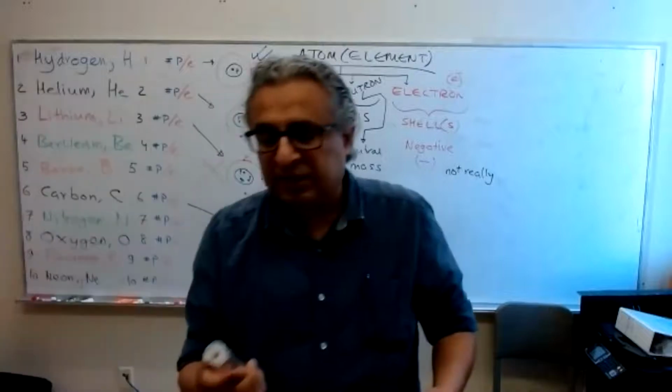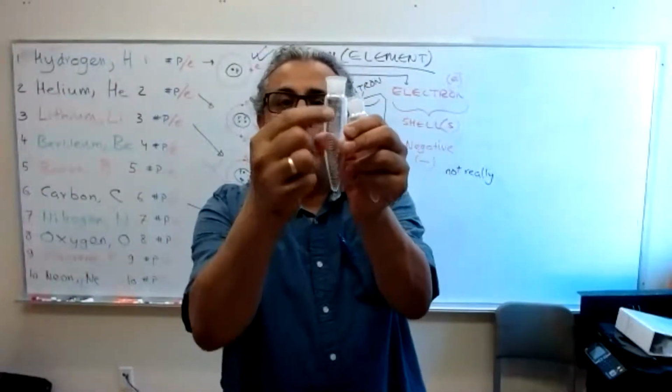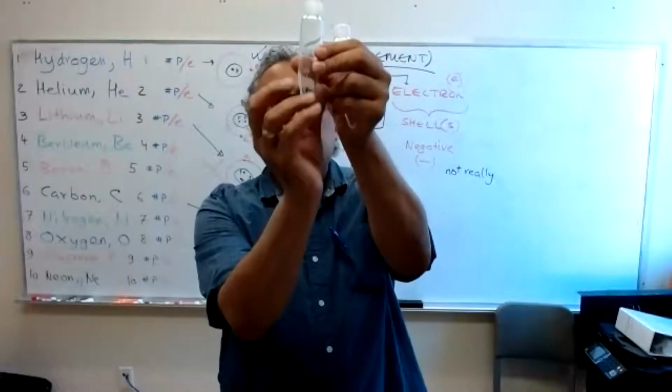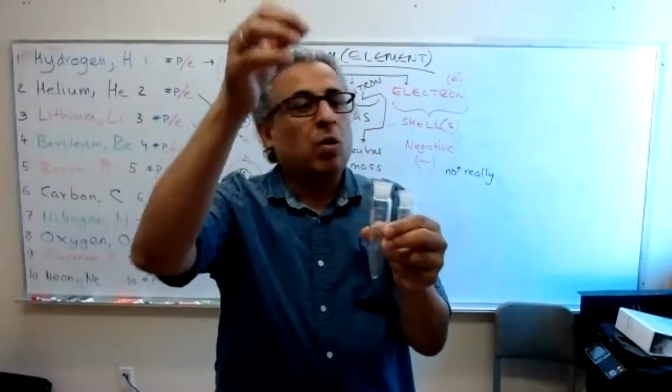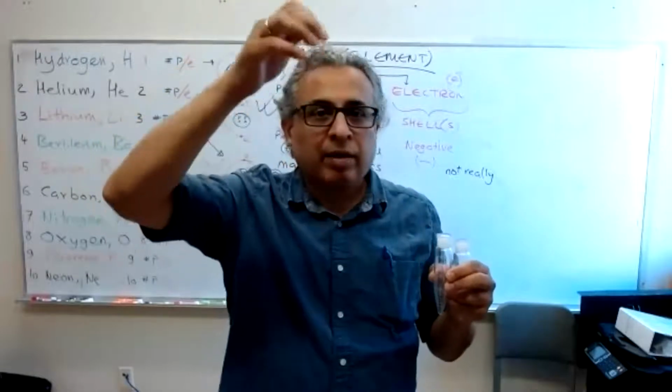I don't have an example of a test tube, but test tubes usually don't look so fancy. They don't have the gradations, the graduated lines. It's not tapering down. It doesn't have a ground glass joint. It's just an old-fashioned, simple, really boring looking tube.